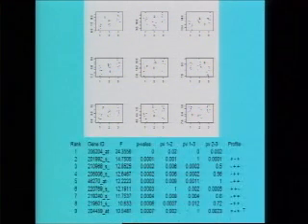So here the first gene, rank 1 gene, has a different profile in all the 3 groups. If we proceed to the rank 2 gene, the profile as far as the sample shows is more or less the same in the first and third group, but distinct in the second group. For the third gene, it is more or less the same in the second and third group, but slightly different in the first group. So we observe all these strip charts, and along with that, the p-values of the pairwise tests.